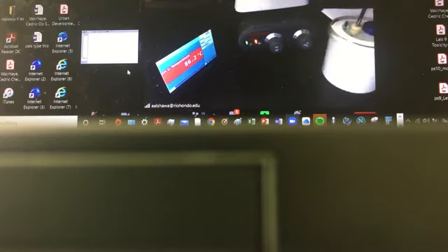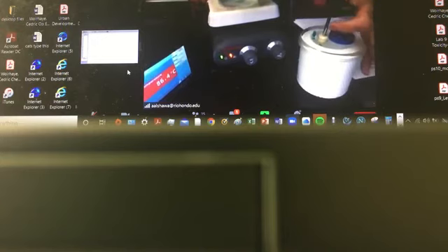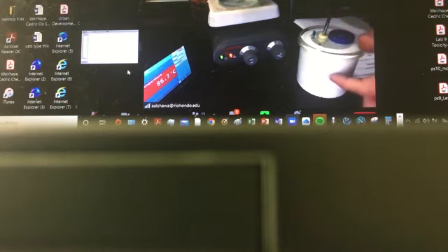So this measures the temperature of the metal inside the hot water. I've got two thermometers. The second thermometer, which is this one, is inside the calorimeter and measures the temperature of the water, because I measured almost 75 grams of water inside that calorimeter. So the second thermometer is measuring the temperature of that water inside the calorimeter.